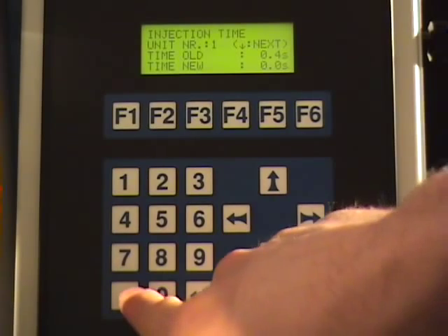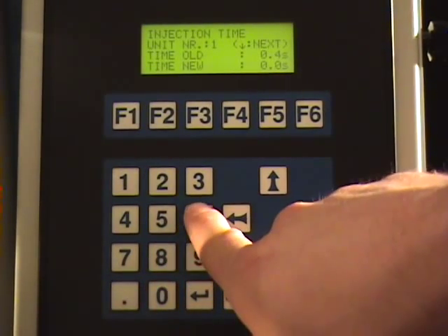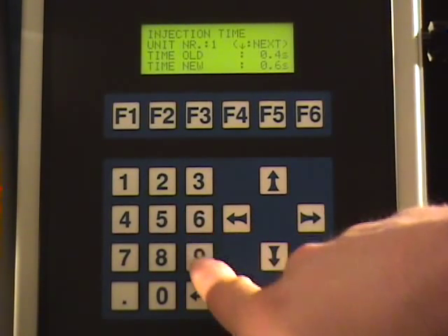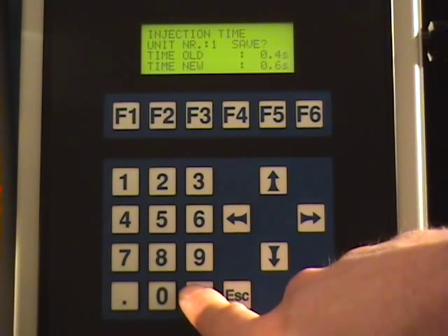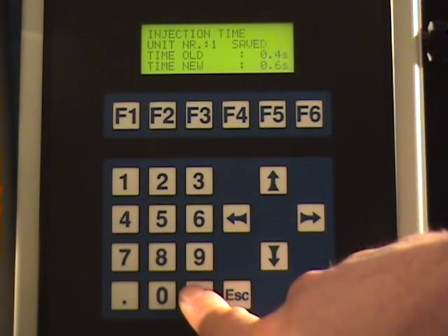Next, the injection time needs to be set. This is the duration which the solvent valve is opened, allowing solvent to be injected. Changing this value, you can control the volume of solvent that is injected each cleaning.